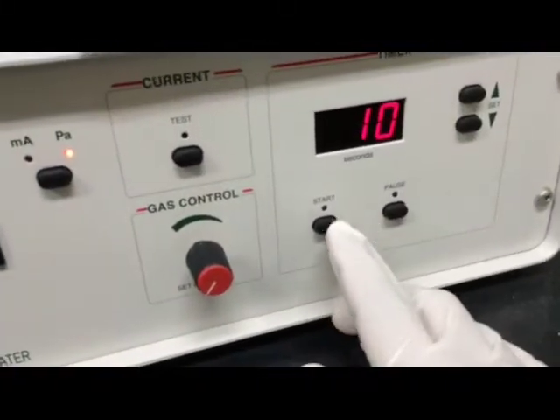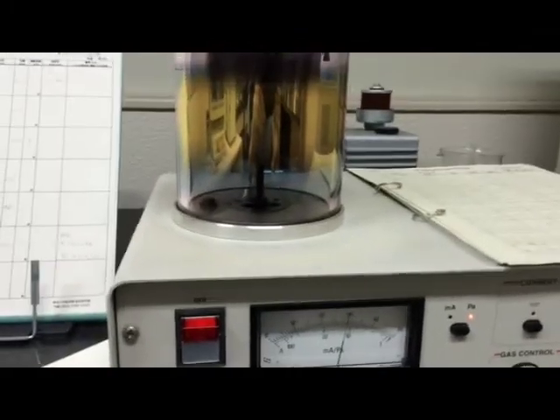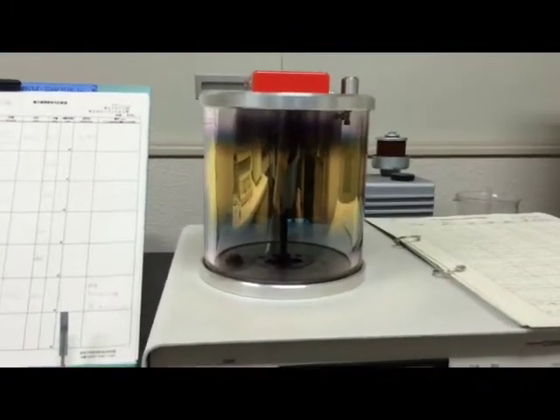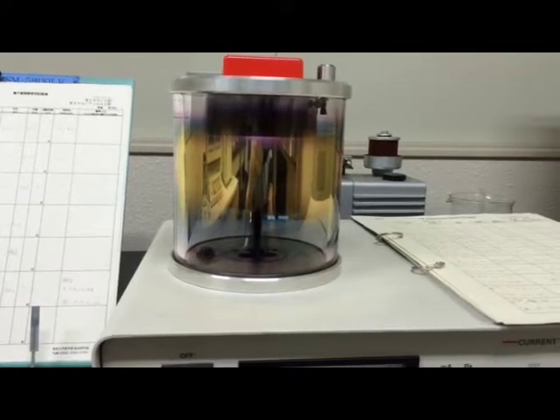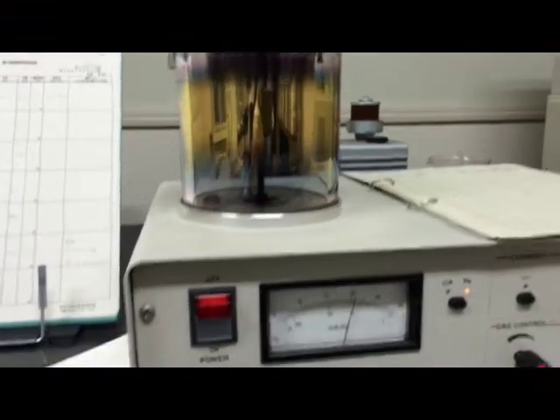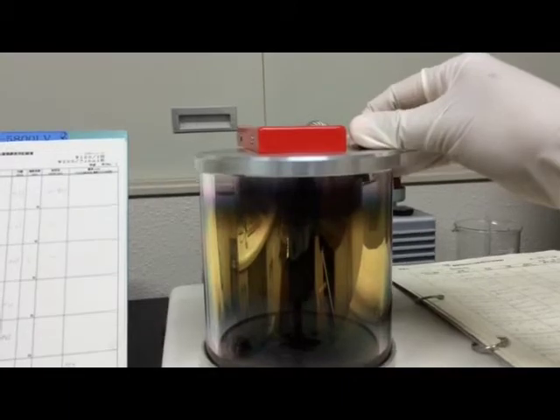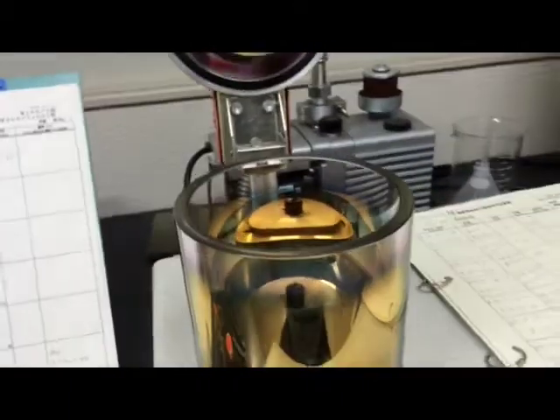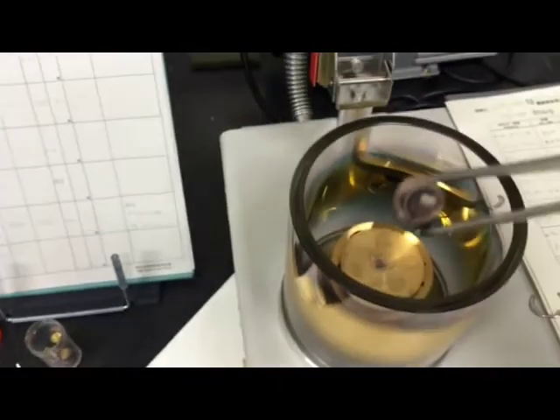Just push this to start. You can see it is working. Once it is off, open it. Be careful not to touch — it is hot. The pin set is there. The sample is already coated.